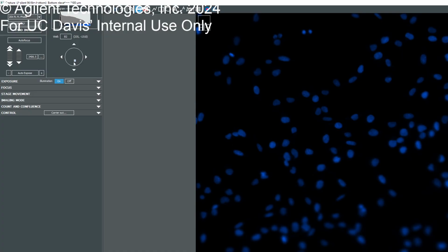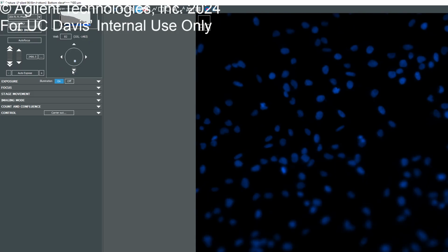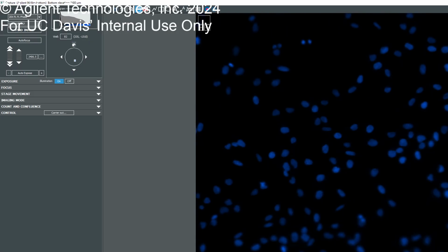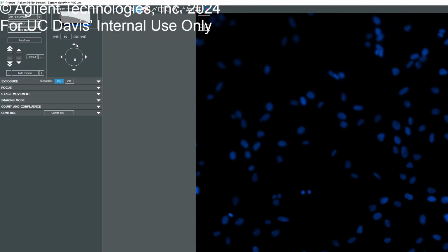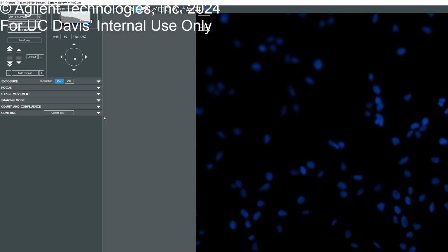it doesn't go the same distance every time. Yeah, this one, you can see 1483, and then it's like 1310. Let me see. Sometimes it's like double the distance. It's very different. Okay, we can test it right now. I don't think it's supposed to be like that, so if that's happening, then I can report it. 1137. So it's moving by 173 microns right now. 965. Yeah, so it's actually doing the same thing.